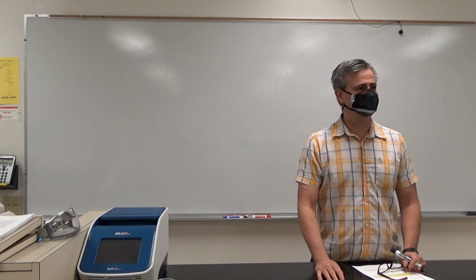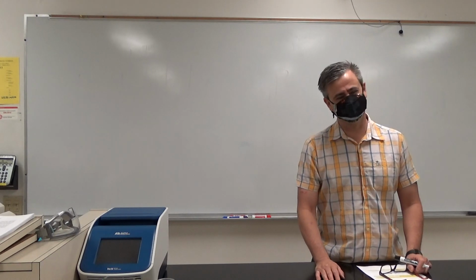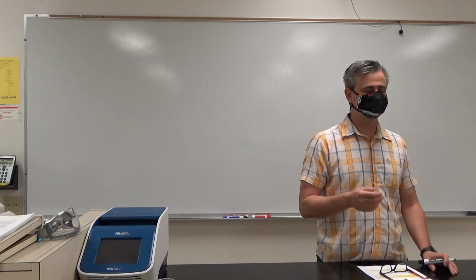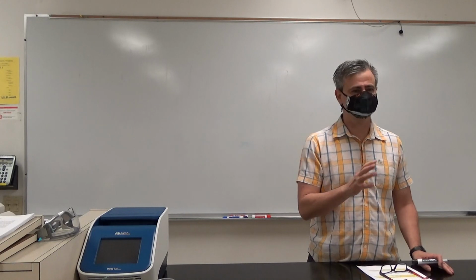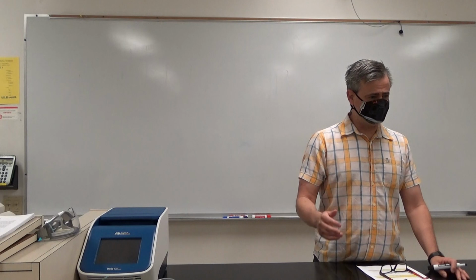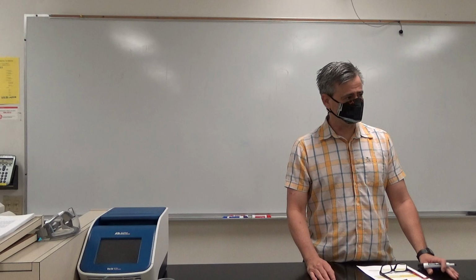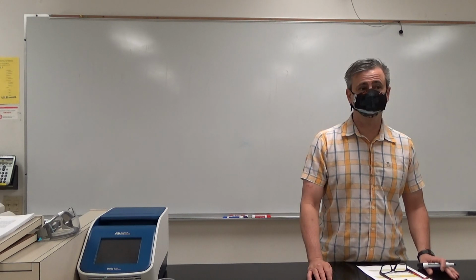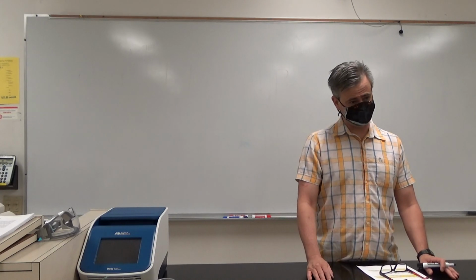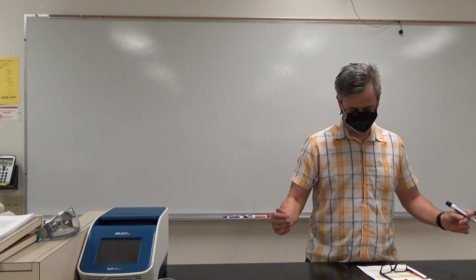And I can't remember if I said there's not going to be any math in this class. If I did, I lied. Because in this lab, there's some math. And actually, in another one, there's some statistics, but it's not too bad. And I really like this lab because we're going to learn about a bunch of different things. If nothing else, it's a really nice introduction into extractions. And extractions is a really important concept in organic chemistry in particular, and other chemistries as well.